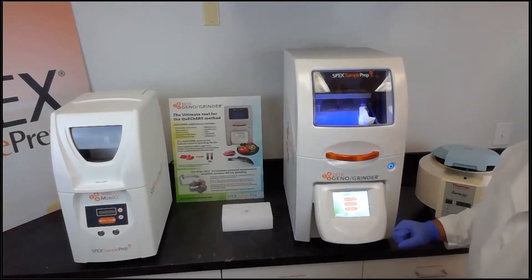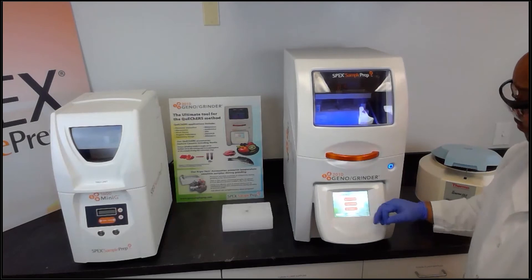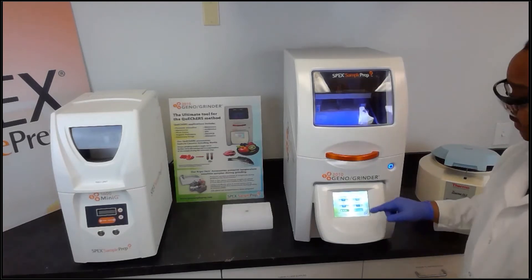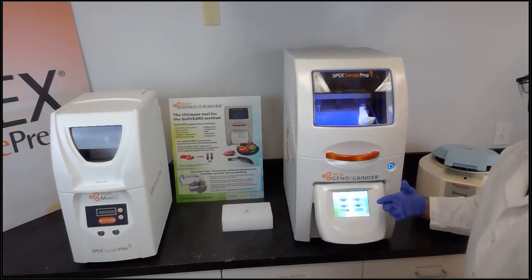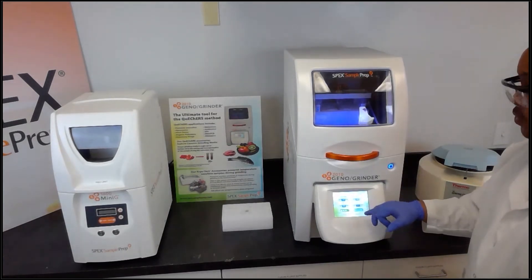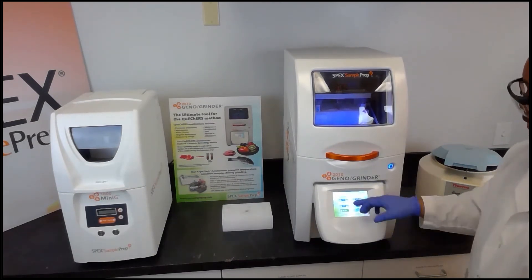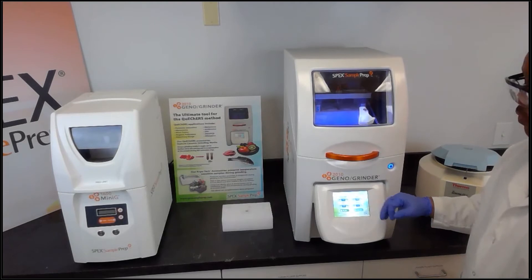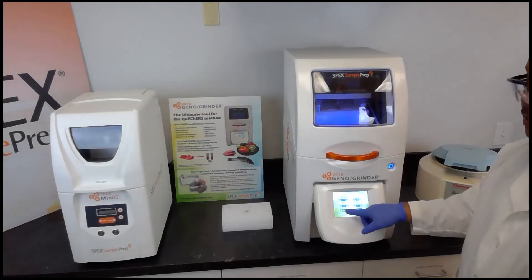Since the GenoGrinder screen is now up, on the display we have the control panel, save protocol, and the resources screen. The control panel allows us to set the runtime, the speed, the number of cycles, and the rest time in between cycles. We can store and name protocols using the touch screen. Here we're going to set the runtime for one minute at a rate of 1500 strokes per minute, no rest time, only one cycle — we simply press run.